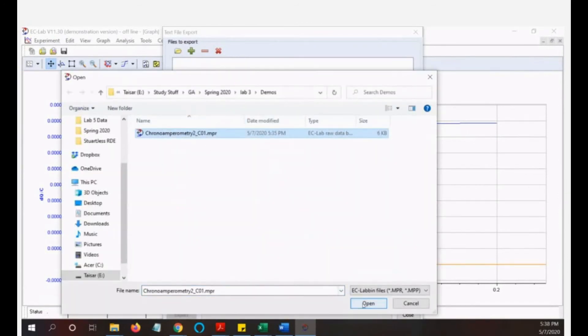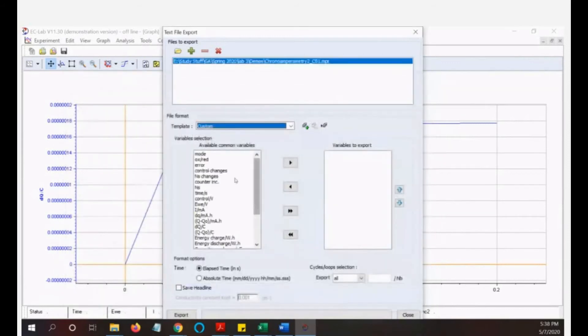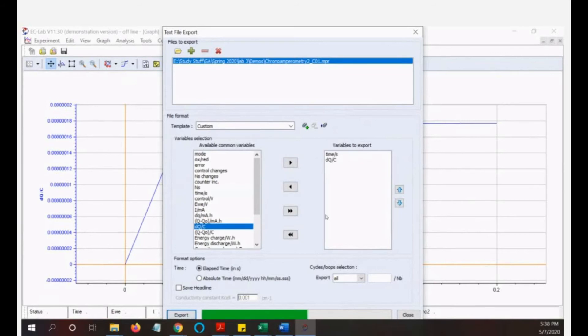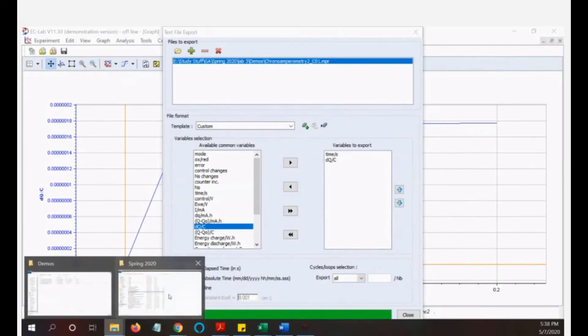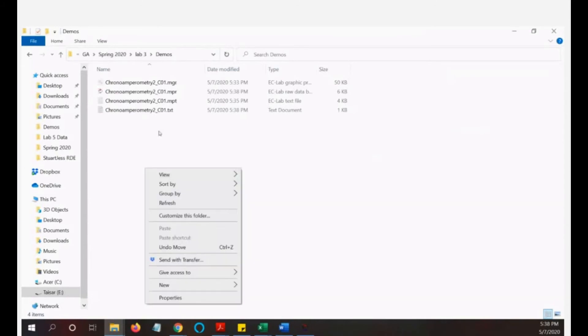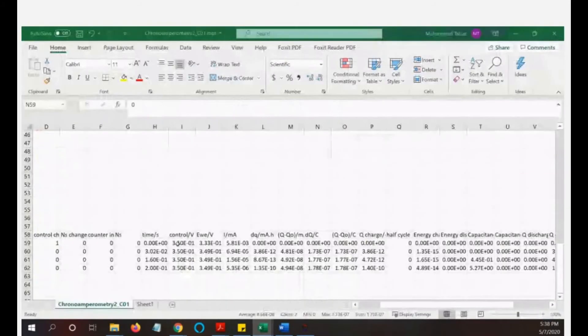We need the time and Q, right? So time, click it, click this. Then Q, click this. So we export it. We see now this dot TXT appears in our folder, and then I will just open it.